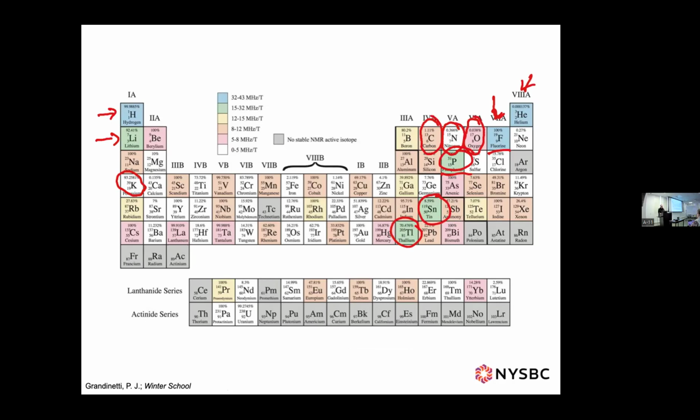One advantage to using direct polarization in these cases is that your T1 is usually quite short, at least in these waters, because they have motions, hopping back and forth. There are other motional aspects happening, and we'll talk a little about that later.